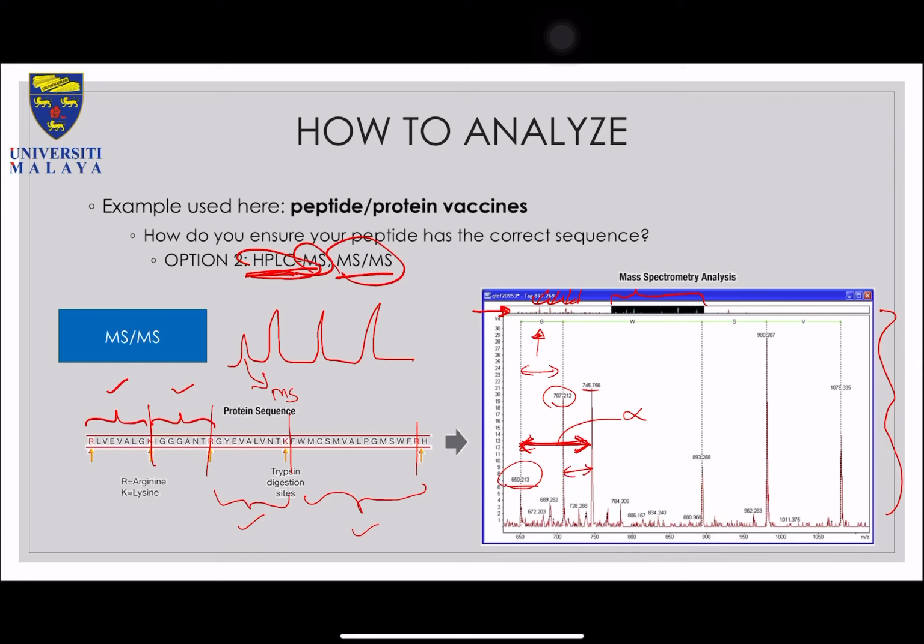Similarly, if you just look at the 707 daughter ion to 745, you don't get any corresponding mass. So we know that this fragment over here is very likely nothing in this particular sense. But if there is actually a peak behind the 650 that you are looking at, there might be something else over there. So you cannot really exclude that the mass that you observe is nothing.